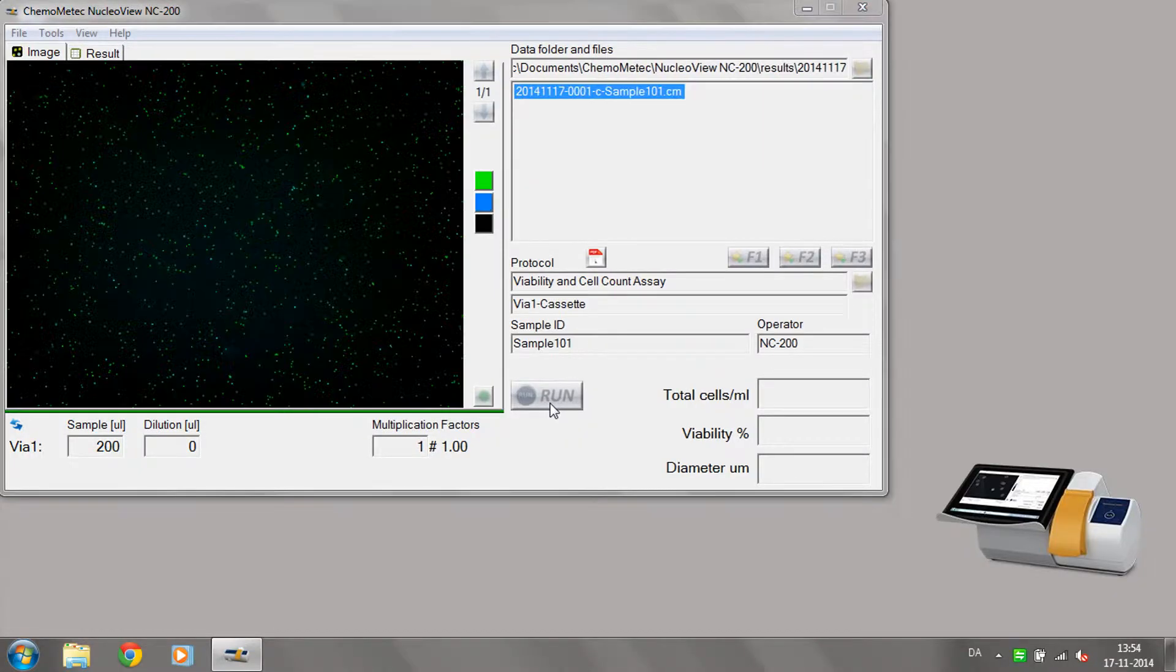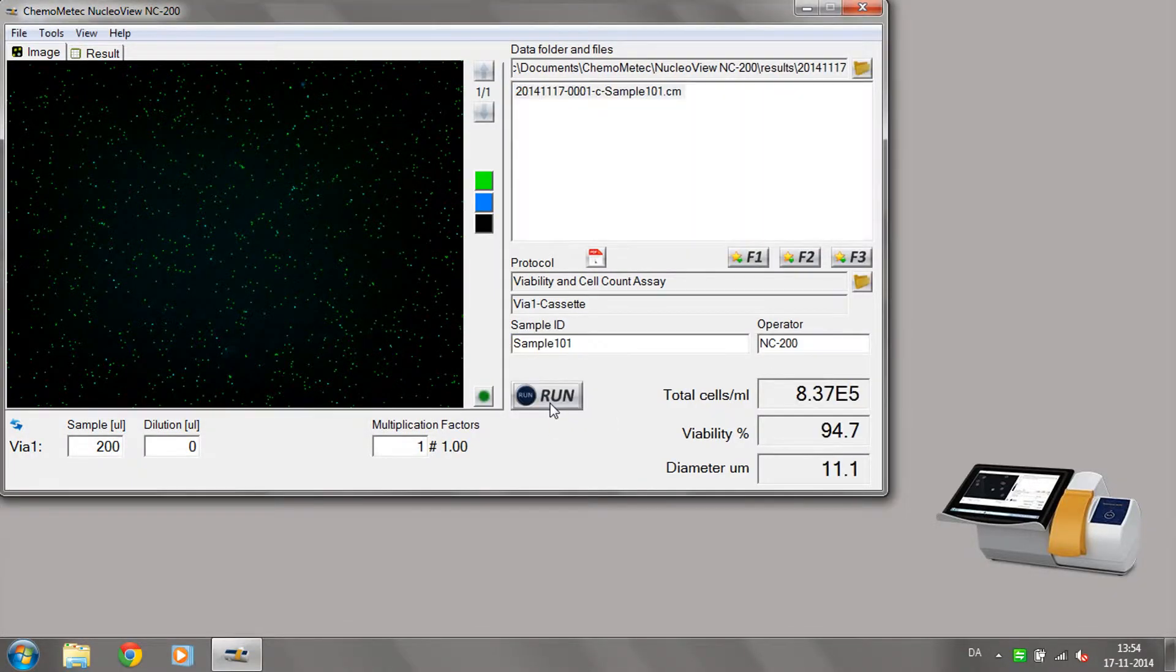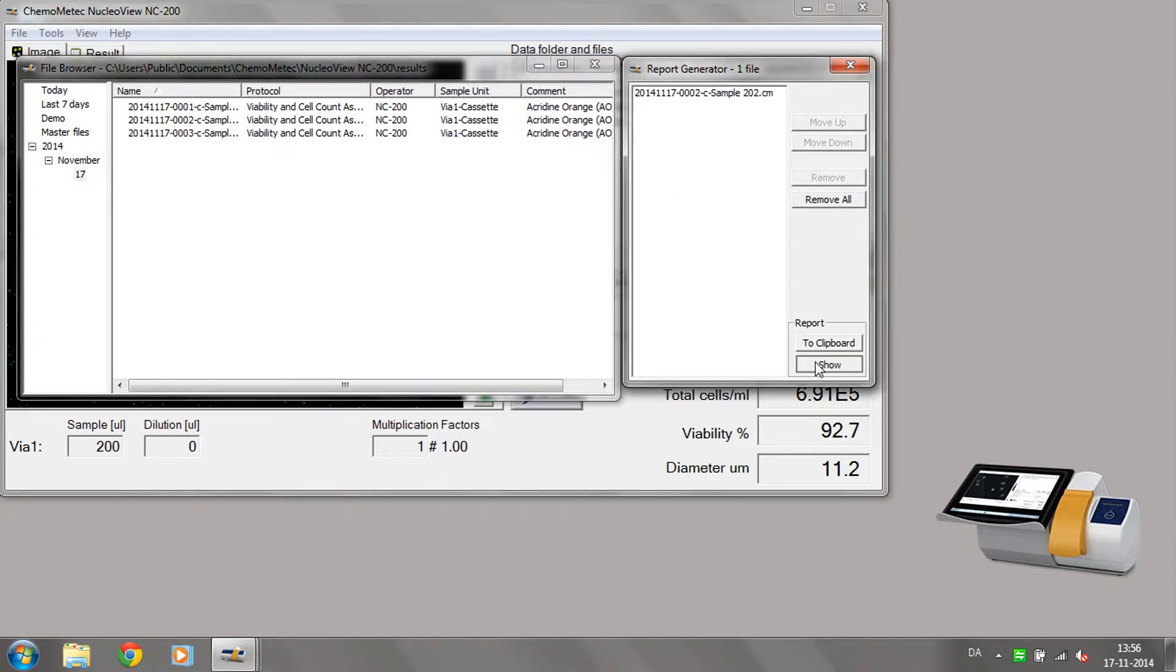In less than one minute, you have your results on screen, in your laboratory management system, or as a PDF to save or print.